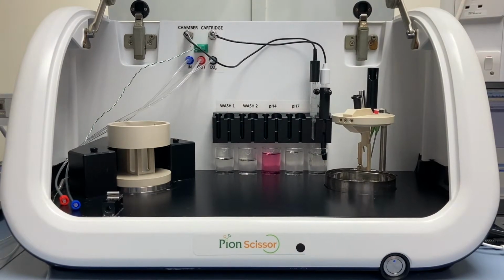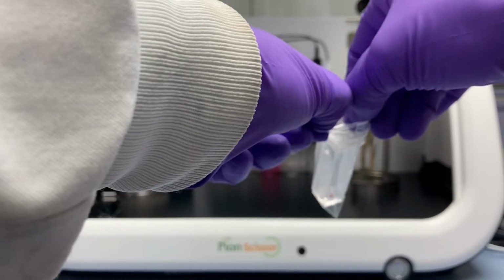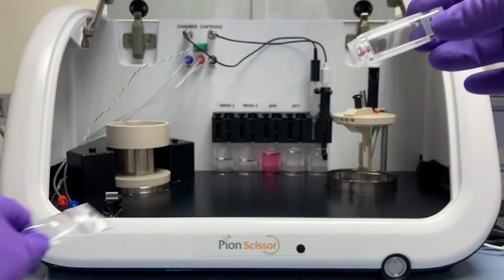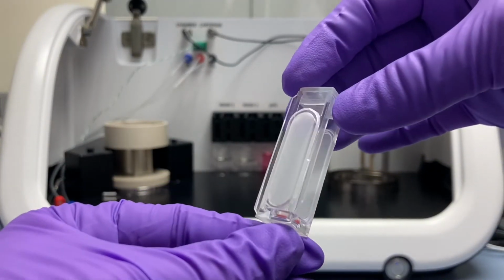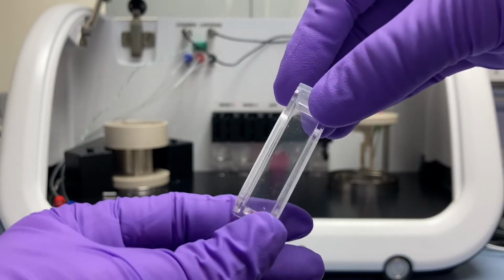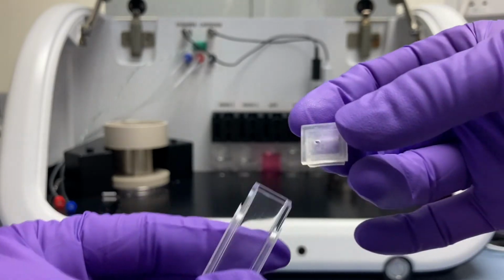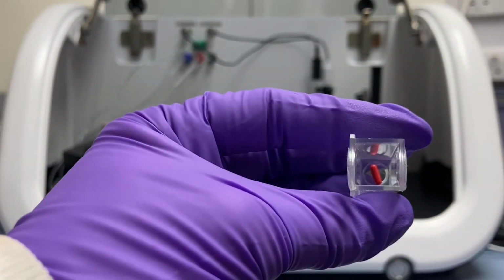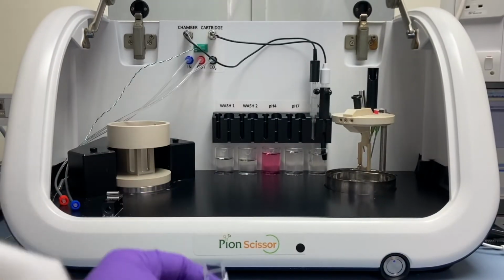Looking at the system more closely, here we have our customized dialysis cartridge, which simulates our subcutaneous environment. It has customized dialysis membranes on the front and back of the cartridge, which allow for diffusion of the formulation out of the cartridge over time. The two other sides of the cartridge are clear to allow the LEDs in the system to read through the cartridge during the experiment in order to monitor the physical stability of the formulation upon injection.